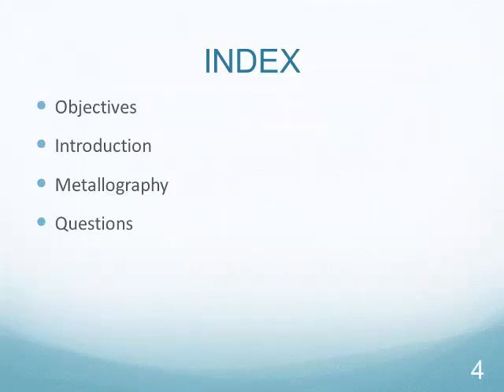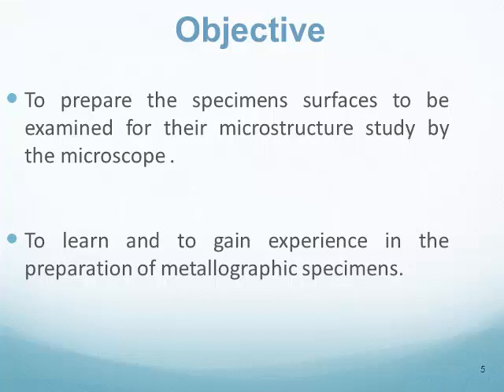Step by step, we are going to understand objectives, introductions, metallography, and questions. The objective of this lesson is preparing the specimen's surface to be examined for the microstructure study by the microscope, and to learn and to gain experience in the creation of metallographic specimens.